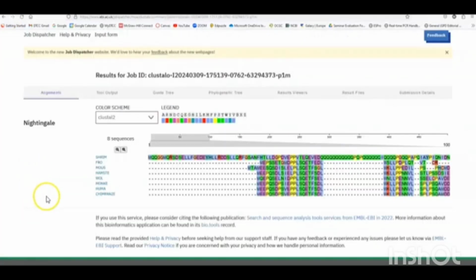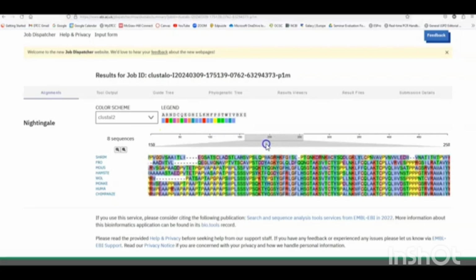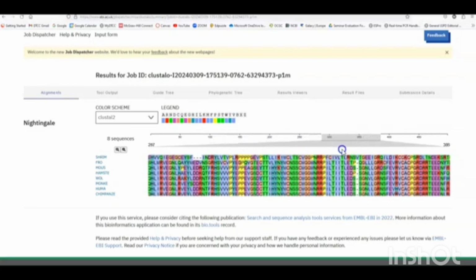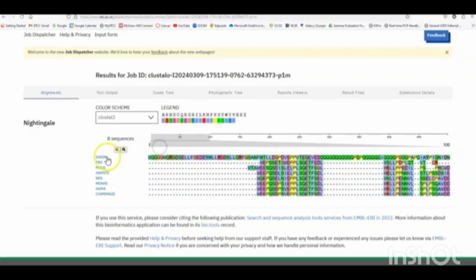that you have given. Now here in the result that is obtained, you can see a series of dots and you have continuous aligned sequences. Now the dot regions are basically indicating that these are distant regions, the non-conservative regions, and the continuous line sequence are the one in which you have phylogeny, or there is a close relationship between the organisms.